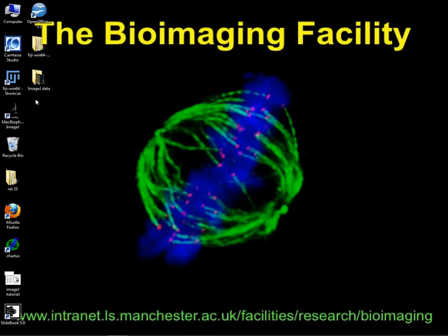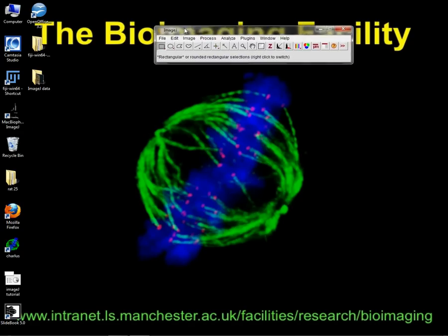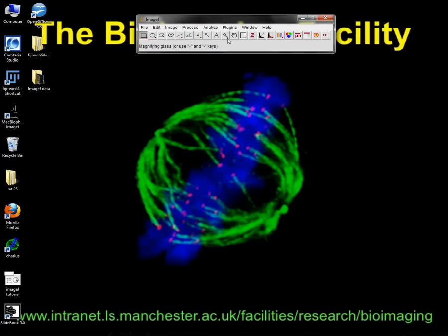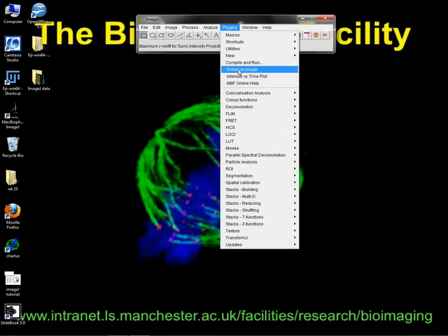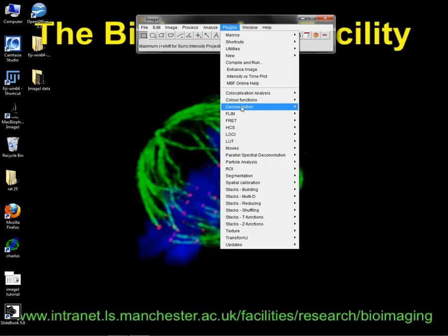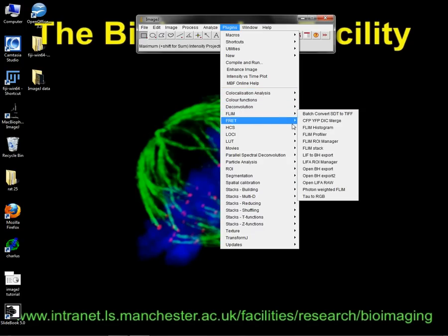Okay, so if I launch Mac Biophotonics, when you unzip it, you just get them on the desktop. So here we are, here's the Mac Biophotonics. And this is what I was saying about the plugins getting nicely ordered by doing it. So under the plugins list, there are all the goodies that you get preloaded with the MBF section. And they're all pre-ordered and nicely arranged.